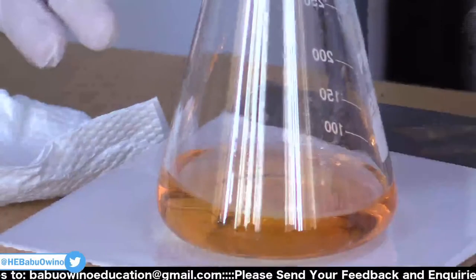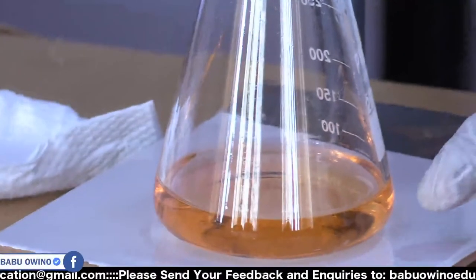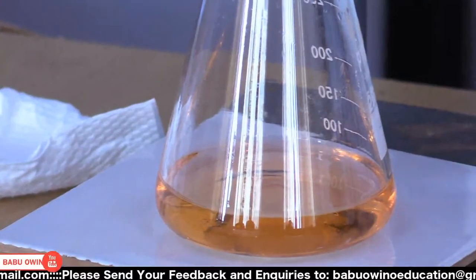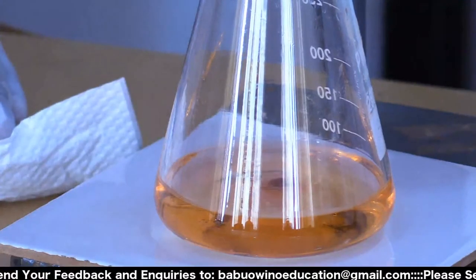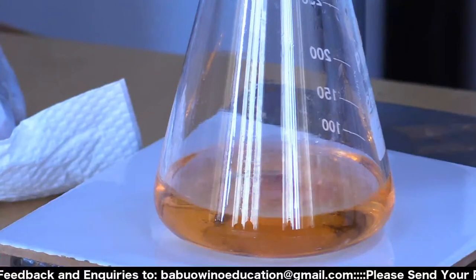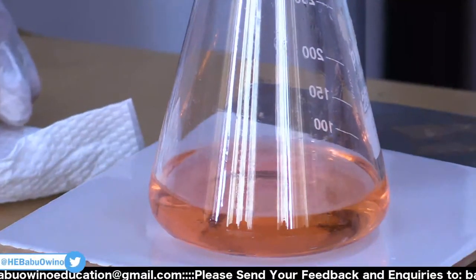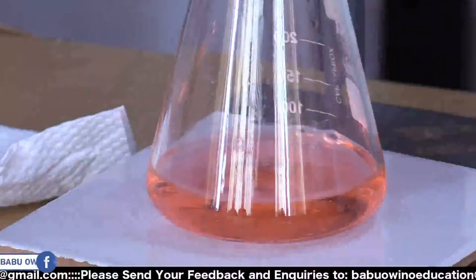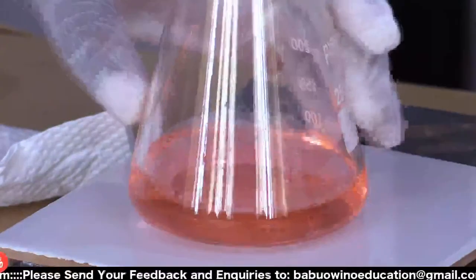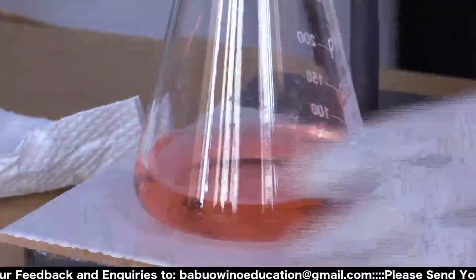You notice there is a change. That is what we would be expecting. If you notice that the change is becoming conspicuous, you release the tap to release the droplets, not just as a whole, just droplets, until you get the full color. What to expect is pink, as you can see. So this is okay.